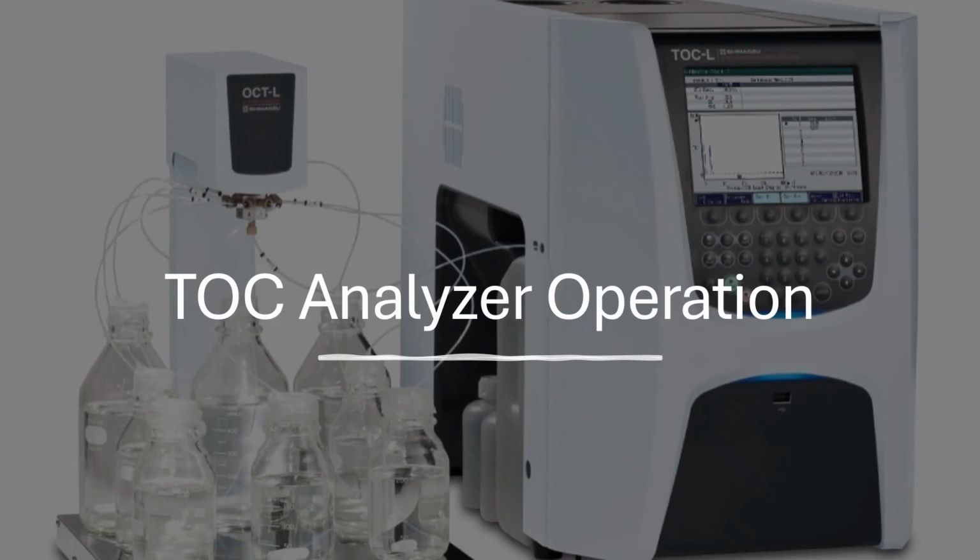So in the previous video we have already discussed what TOC is, its importance, the basic concept and principle, and the key components, right? So let's begin with the operation.